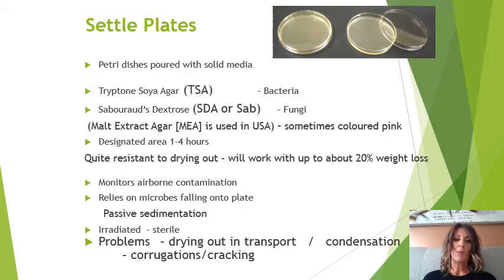So settle plates monitor airborne contamination and rely on floating viable particles falling onto the plate. The plates are irradiated, they are sterile, so they're terminally sterilised. You make up the media, you pour it into the plates, and then they're sterilised in their packaging. We can have issues because they've been terminally sterilised.